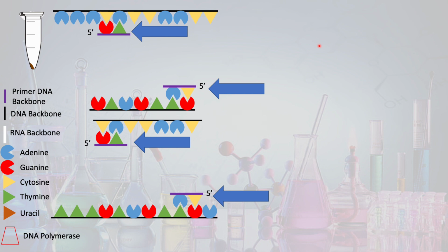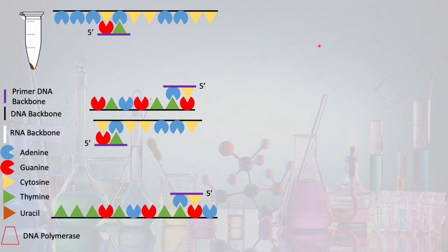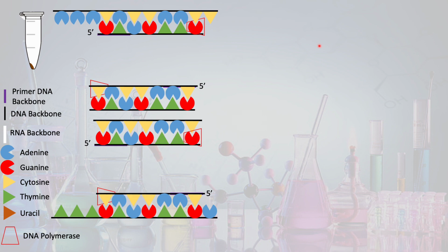These literally serve to prime that DNA polymerase as it copies our DNA segments over and over and over. So we're literally designing sequences of nucleotides that will prime amplification of our genes of interest. And we need to design these specifically for our genes of interest because we don't want to amplify other genes, right?